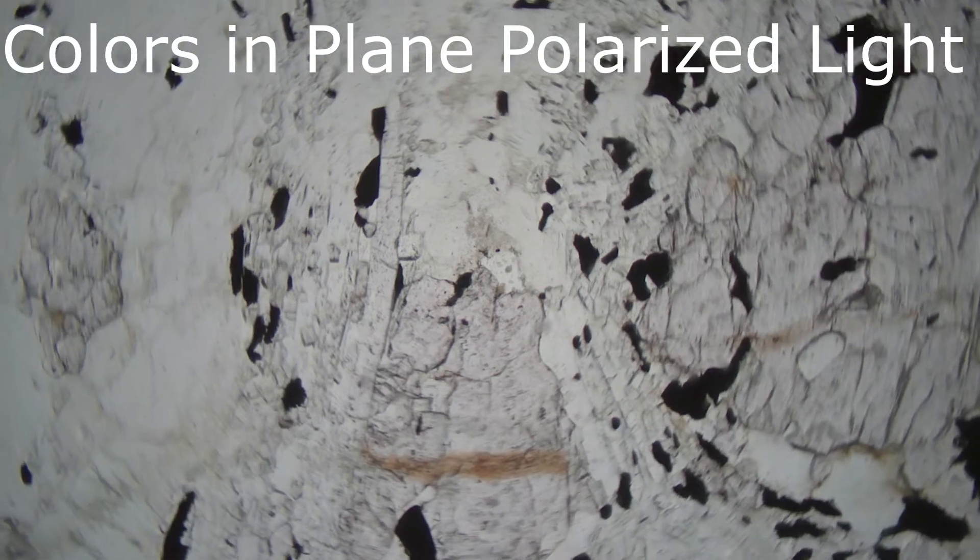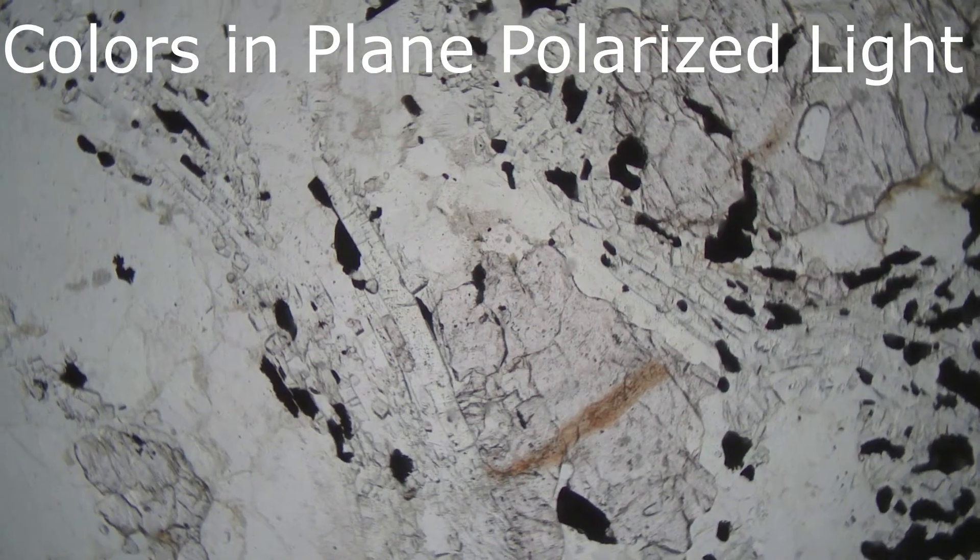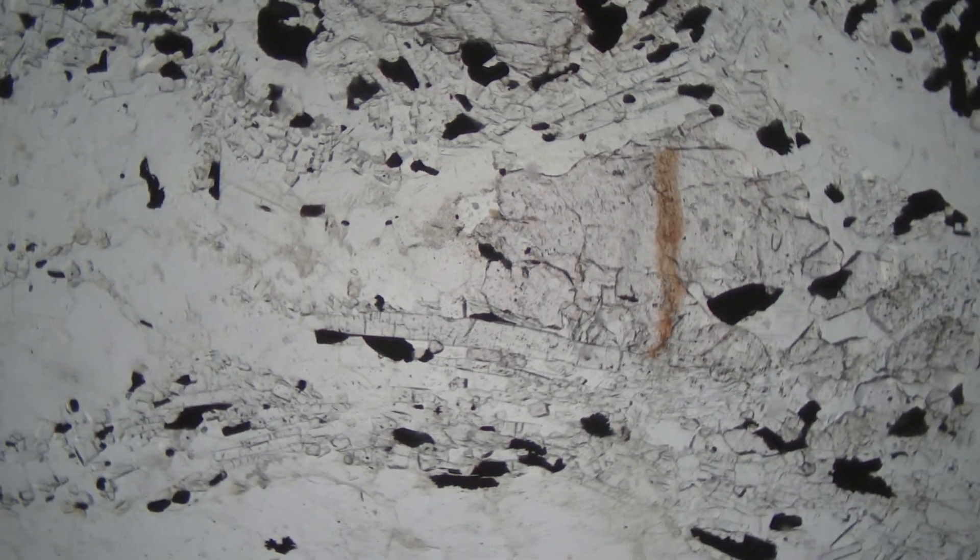Here we see a thin section of a metamorphic rock in plain polarized light. The black grains are ilmenite. Ilmenite is an opaque mineral, which means it will not transmit light even if we rotate the stage.